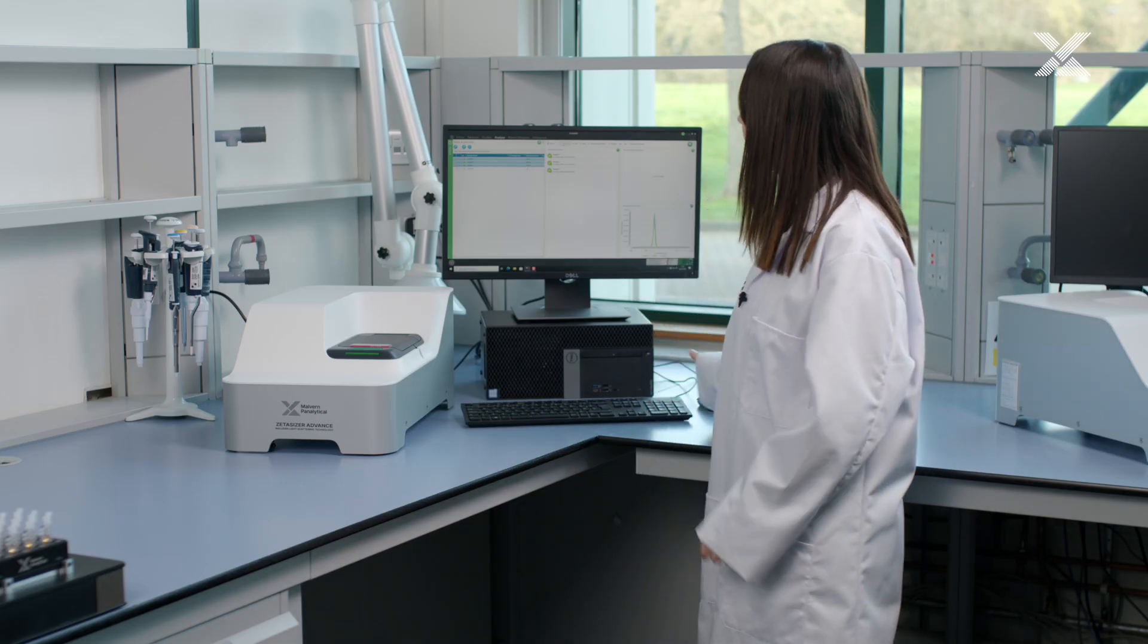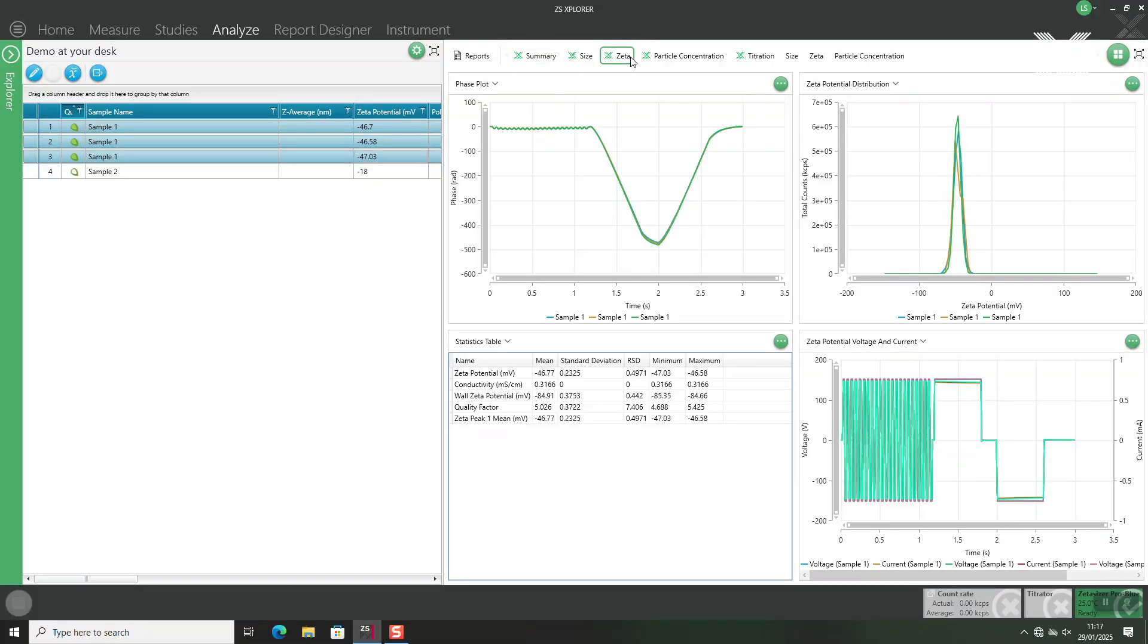If we do want to see our zeta potential results we can select the workspace called zeta which is there by default. So we have access to the phase plot, the zeta potential distribution and also our key statistics.